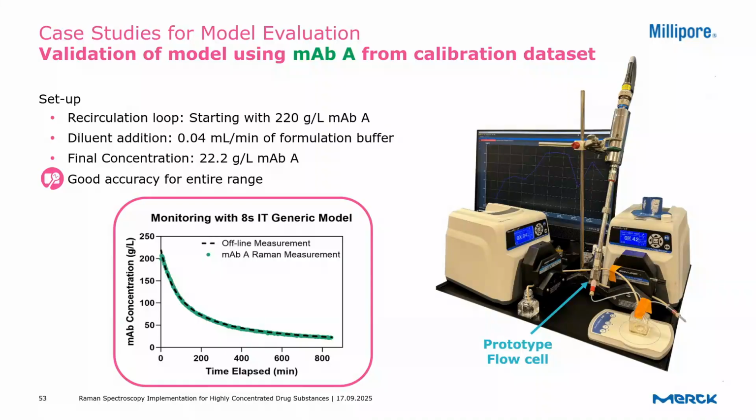So now I'm going to jump into a couple case studies that we have. These case studies display the capabilities of the model built with an 8-second integration time. In this first case, a validation study was performed on just MAB-A using this recirculation setup.